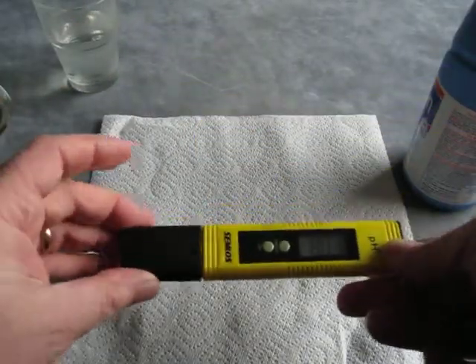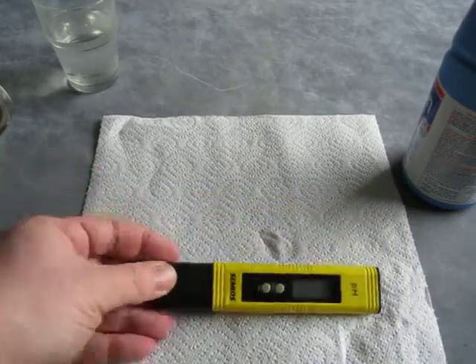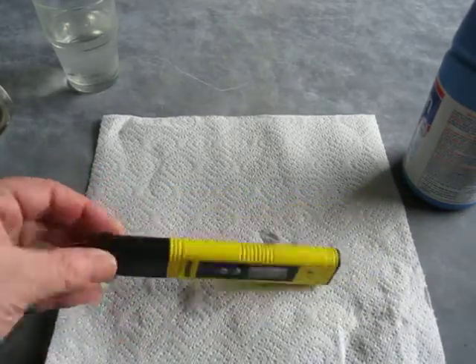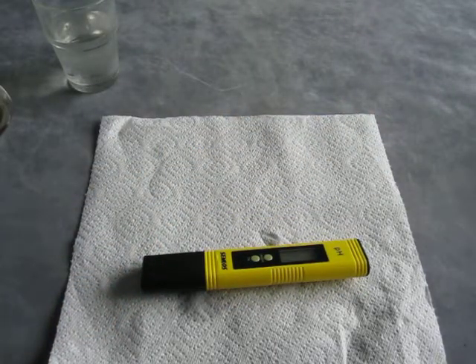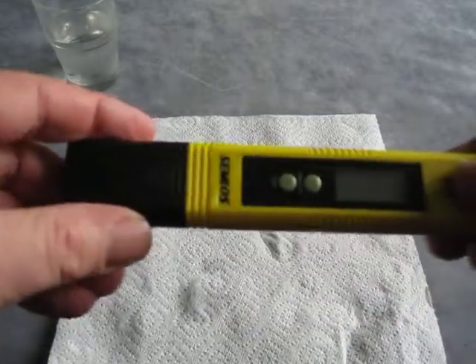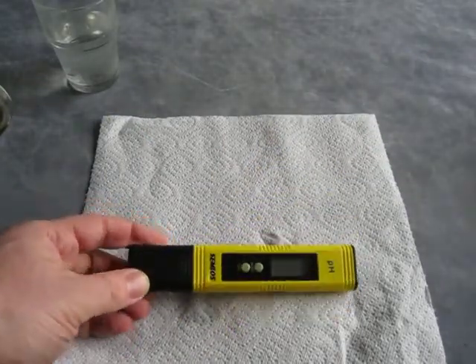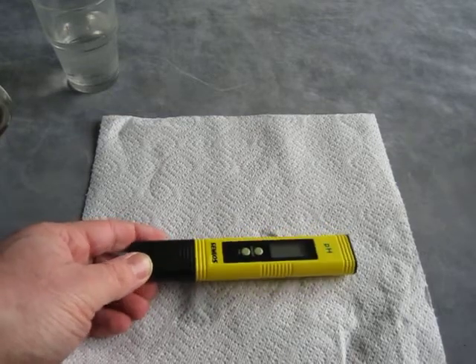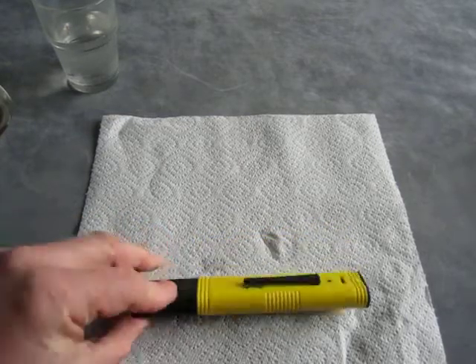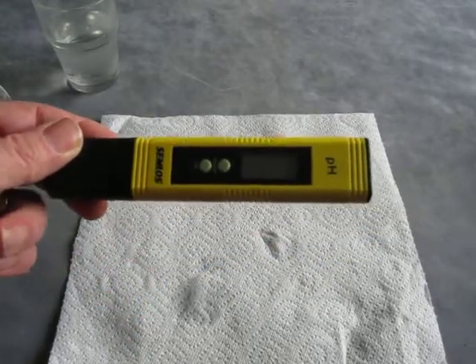So there we go. Once we're done, power it off, pop it back in the case, and it's ready for the next time. Continually usable, it doesn't run out, and it's already incredibly accurate from the factory. Well worth it if you're going to do any kind of experimentation or you're monitoring the acidity of fluids or water — this is ideal. It's the Semlos digital pH meter. Thank you.